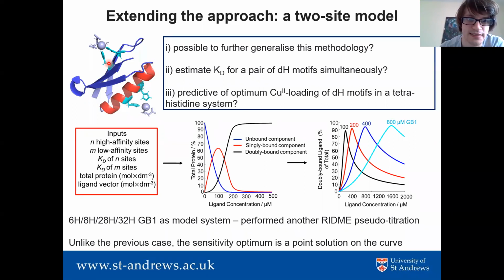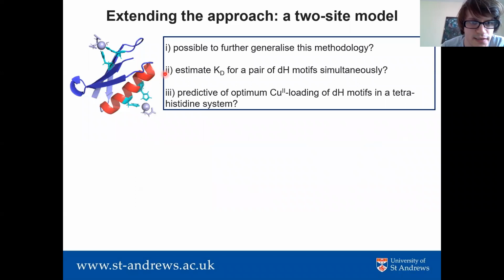NTA is tetradentate, I think, and therefore the copper has only the two remaining sites. I see. So you are saturating other coordination locations. Yes. So you are completely right that this would happen if you had copper without your chelator, but in this case, you get around it. Yeah. Clever.